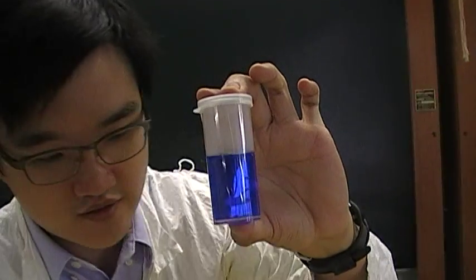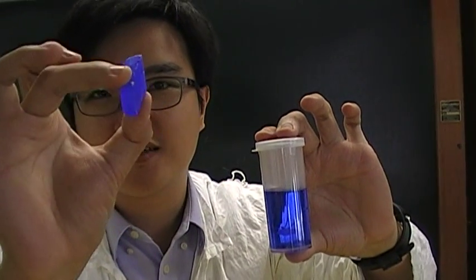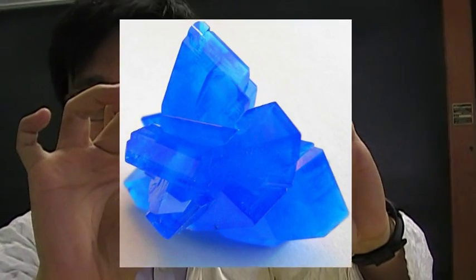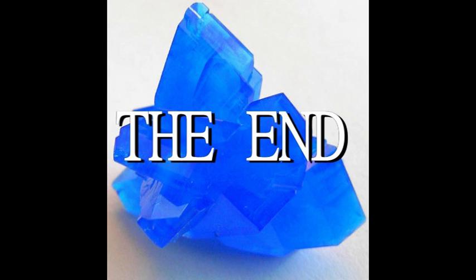After that, a big crystal will be formed later. See? This is an experiment of crystallization.